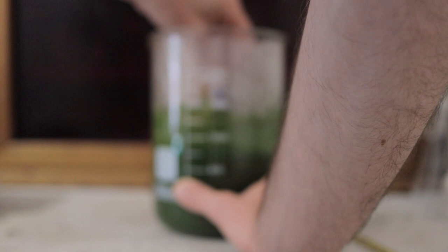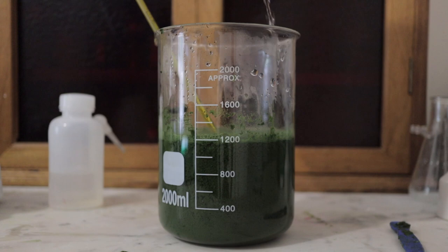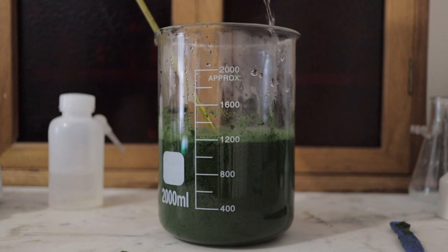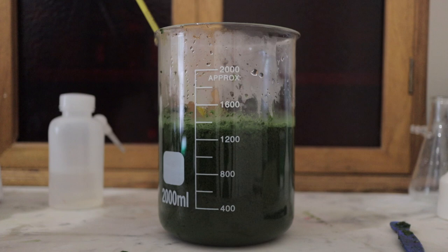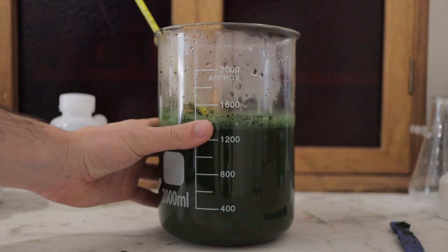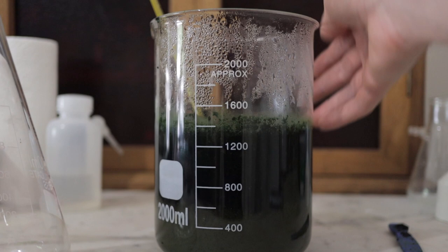Once I get this set up and mixed in, I'm probably not going to stir it at all for the rest of the extraction process. I'm adding a little more water to bring the temperature up — we're at about 49 to 51 degrees, which will do fine. I'm just going to leave this for two hours and we'll come back to do the filtering process.